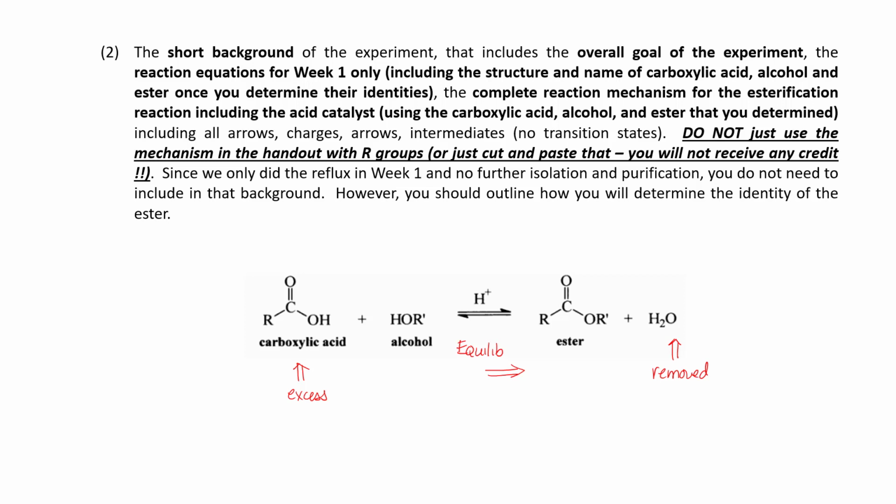I'm going to be honest, I measured out 30 mils of carboxylic acid and alcohol, so whether or not we are in excess of carboxylic acid, I'm not quite sure. In the future, we would definitely run in excess carboxylic acid to alcohol. Since I know what the unknowns are, I could have figured out exactly how many mils of each to use.